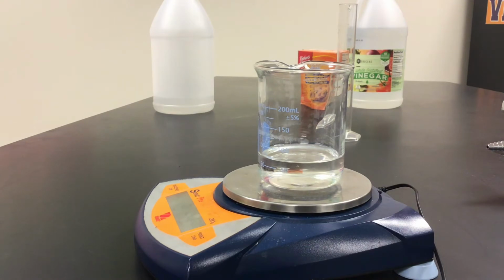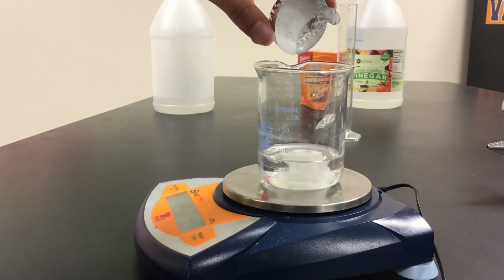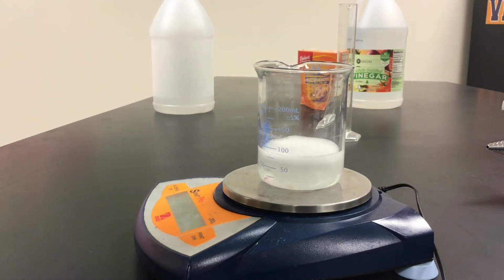Next, I put the beaker back on the balance. Then I'm going to slowly pour the baking soda into the beaker. You might see some reaction. Make sure to put the baking soda in slowly so nothing comes out of the beaker.